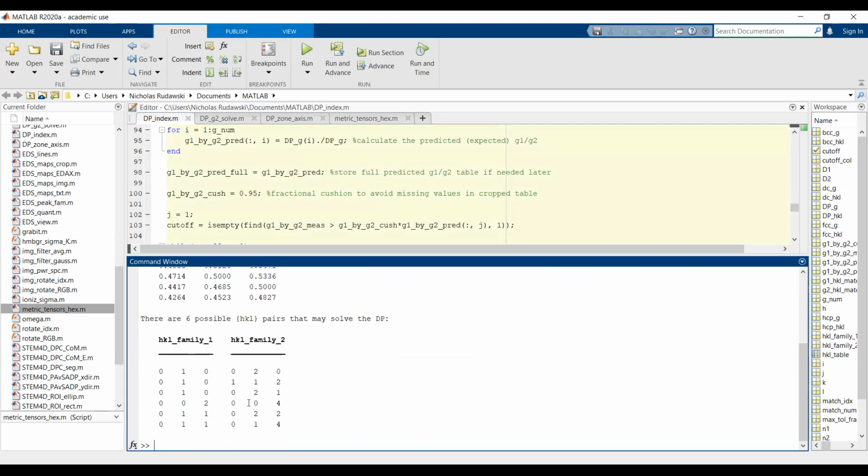Again, let's look at ones we can pitch. This guy we can pitch. Okay. L's are the same. In fact, this is just a linear multiple of this. Okay. This is also just a linear multiple of this. And this is not a linear multiple of this, but the two L's are both non-zero. Okay. So those can both be pitched.